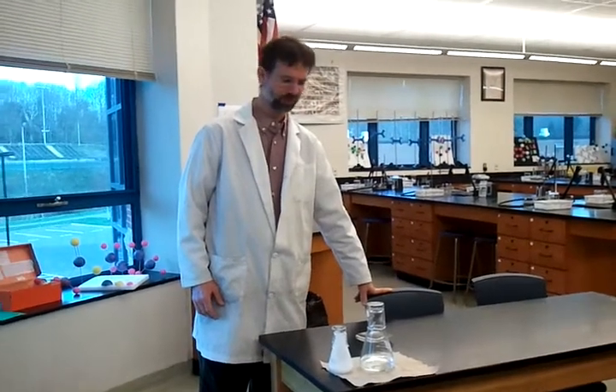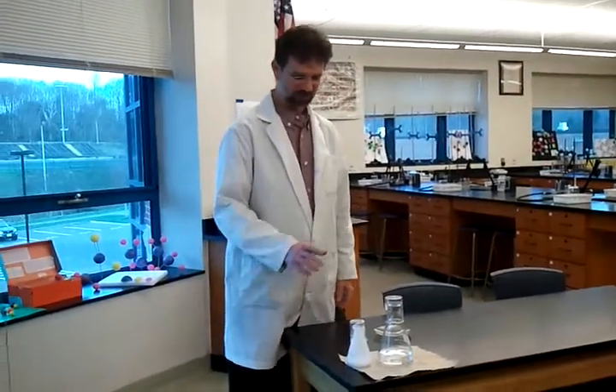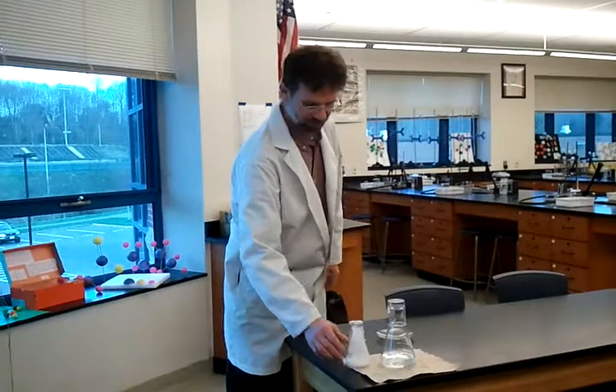We are demonstrating what a super-saturated solution is here today. The way to make a super-saturated solution is you take a solute, dissolve it into a solvent until it reaches its saturation point.